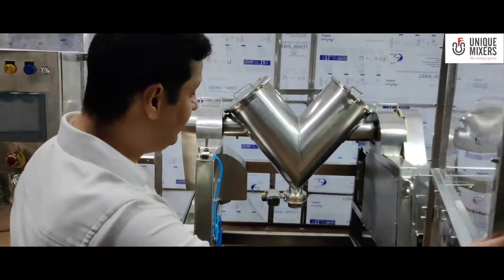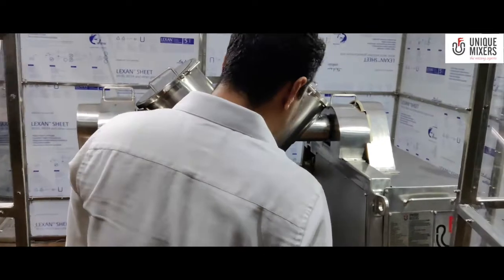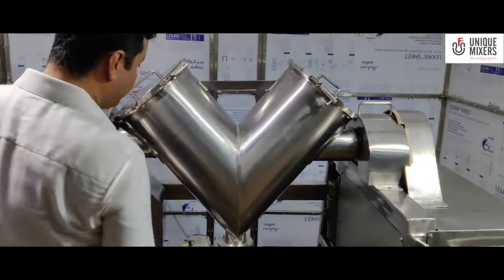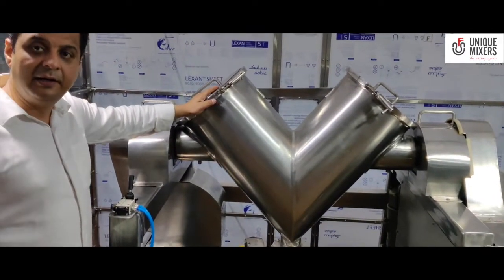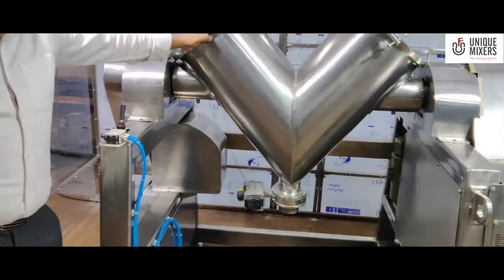That's the unique 75 liter working capacity V-blender with stainless steel 316L contact parts. The non-contact parts are stainless steel 304.